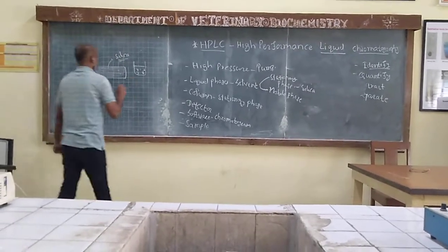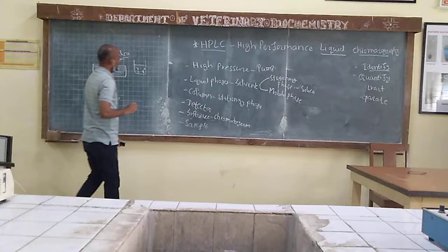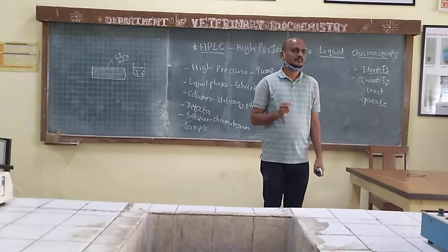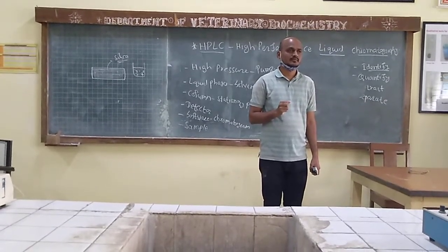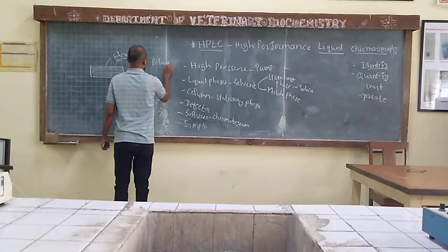For example, how to separate this molecule? When we run this apparatus, the pump gives the pressure, and then by their molecular polarity, the substances are separated. Polarity.